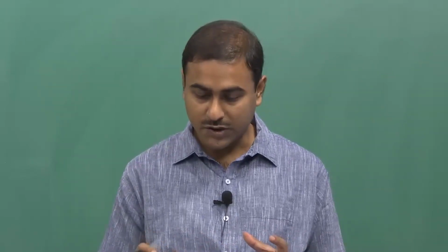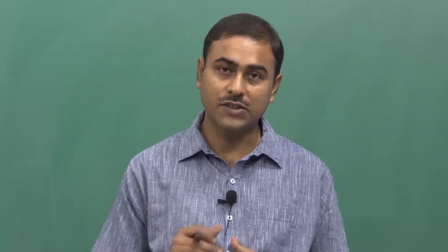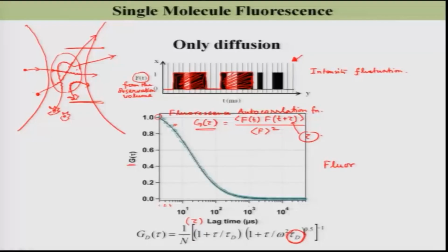So this is a very important application in single molecule fluorescence, and this particular experiment is known as fluorescence correlation spectroscopy, in short form known as FCS.